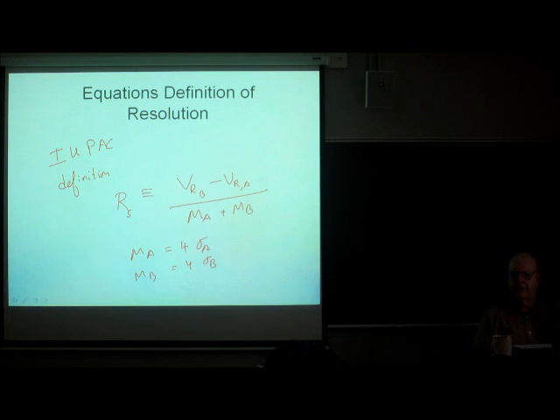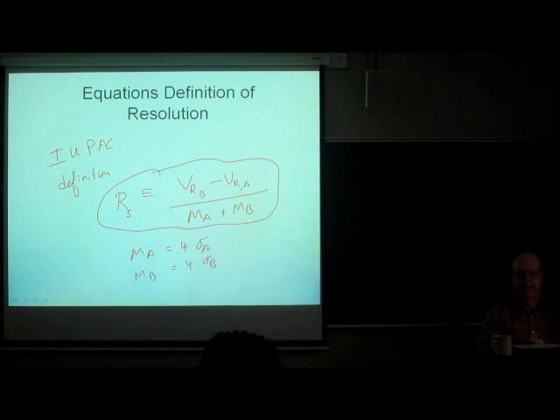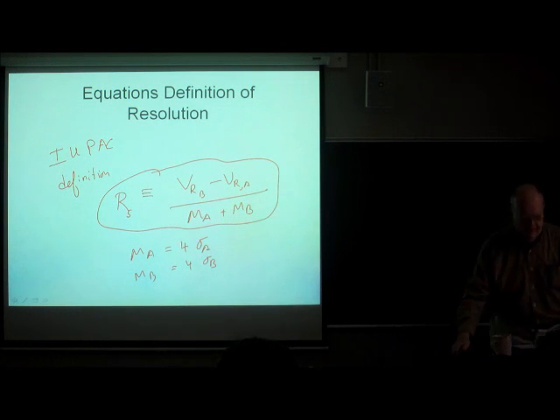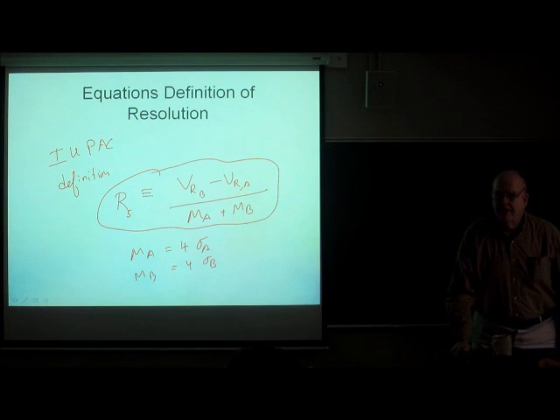They don't have to have the same sigma. The definition still works. Okay? This is the central idea of resolution. It's the difference in retention relative to the peak widths. Okay? Critical. This equation you memorize. All right. The quiz will appear on the, yes?